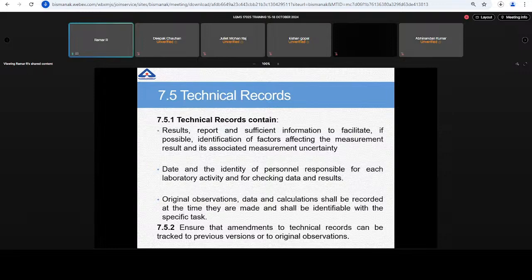Sometimes the register is very big, so you cannot bring it to your working area, or many personnel are using the same registers and it cannot be given to any one person. In that case, technical people can be given small notebooks to carry. Those notebooks must be official notebooks, not rough notebooks, to record all the information.